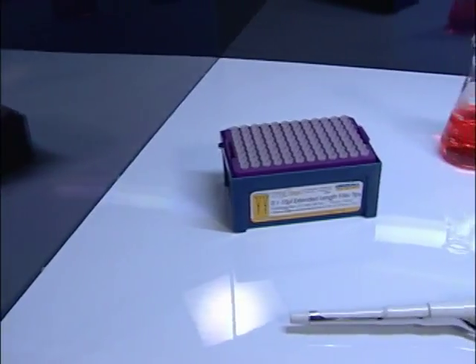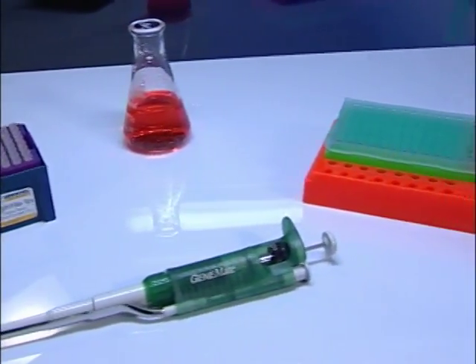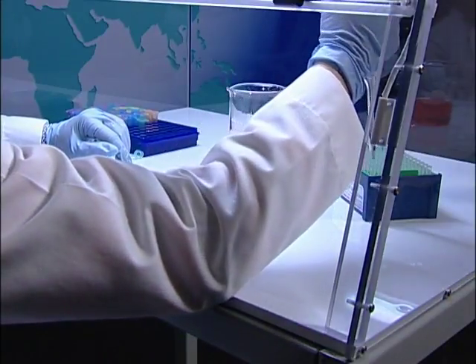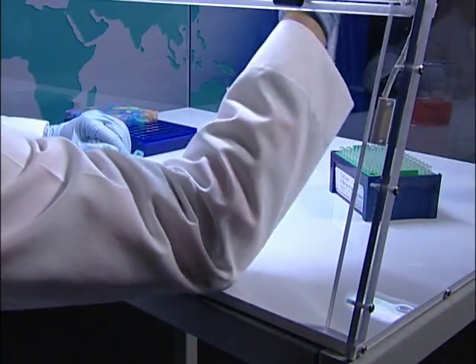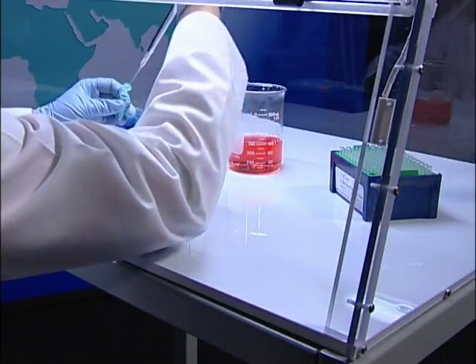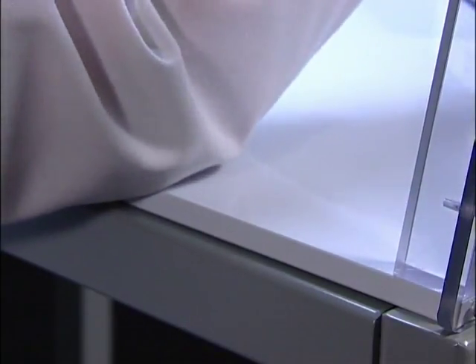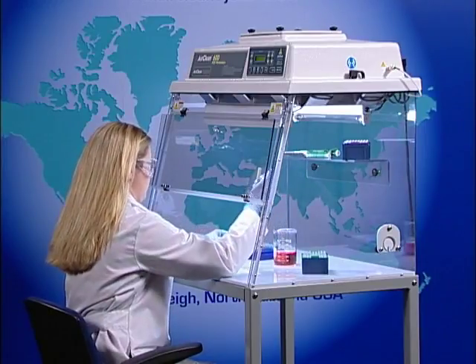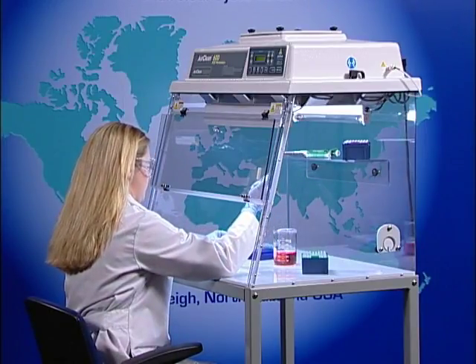The base is an integral part of the AirClean Systems PCR workstation. Each base is made of a custom extruded polypropylene blend that not only reflects ultraviolet energy, but also allows for easy cleaning between amplifications. The base has a smooth front lip to provide added comfort for the operator during hours of pipetting. AirClean Systems PCR workstations are truly designed with the application and operator in mind.